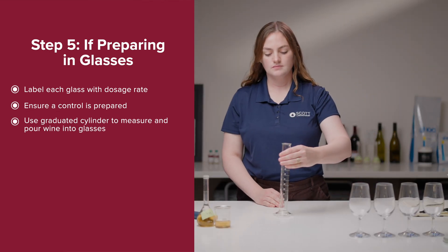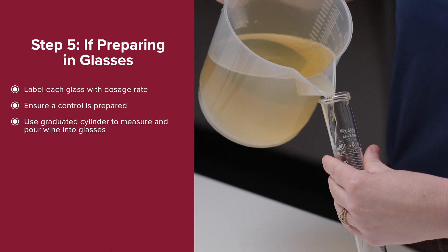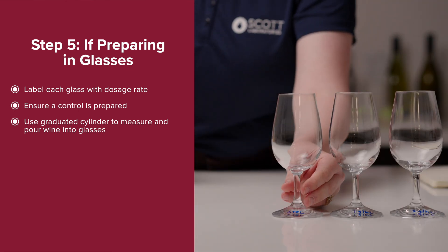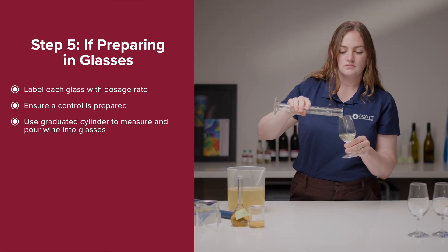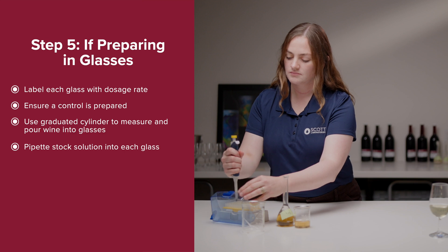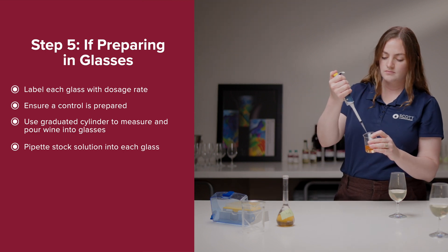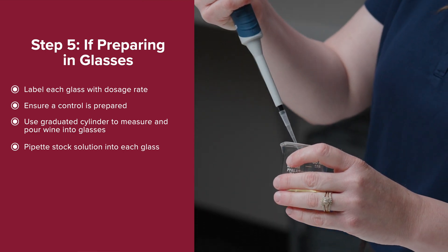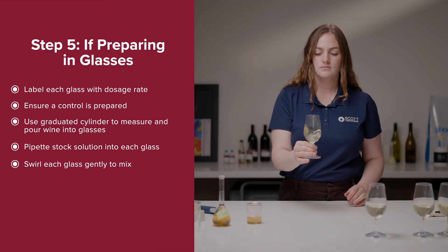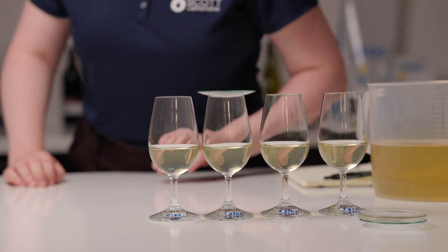If preparing your trial in glasses, label each glass with the dosage rate and ensure a control, untreated sample is also prepared. Use a graduated cylinder to measure the wine and pour into each glass. Pipette the appropriate amount of stock solution into the first dosage rate, referencing your calculations from Step 4. Decanting the stock solution into a small beaker may make this easier. Swirl the glass gently to mix. Cover with watch glasses if you will not be tasting immediately. Repeat with the other dosage rates.